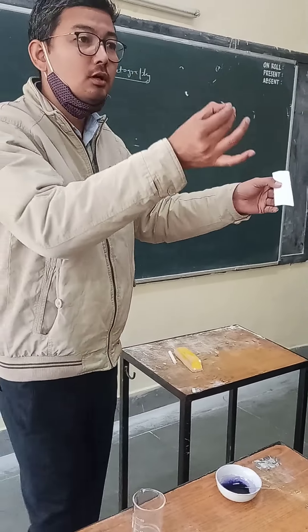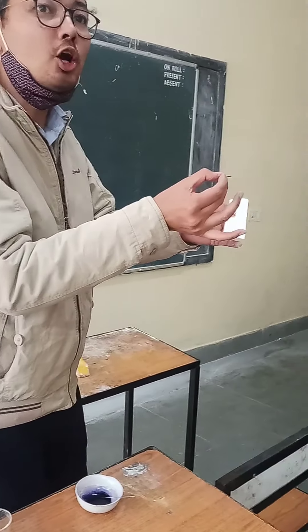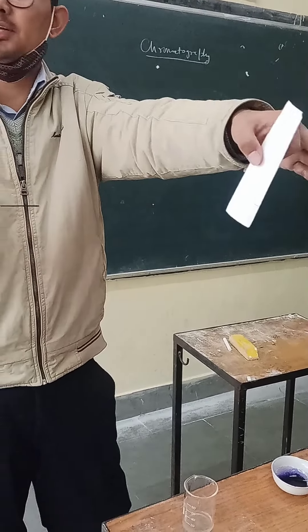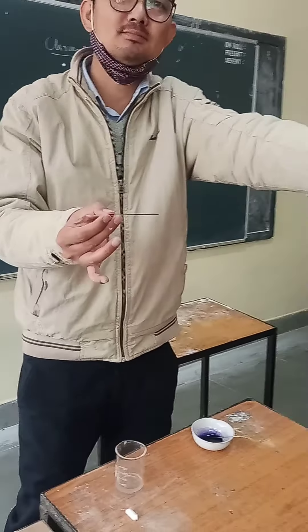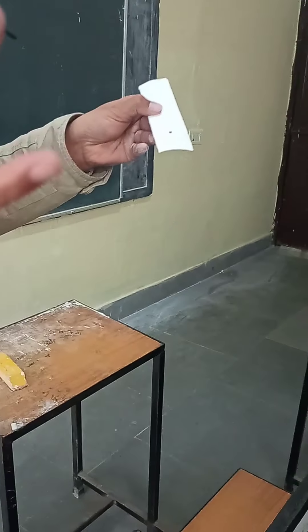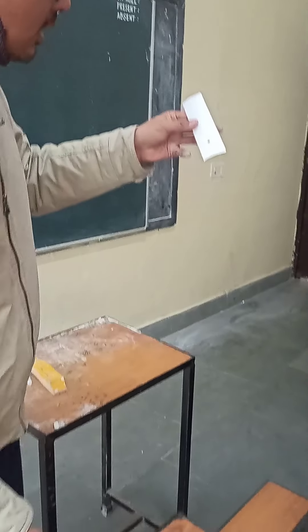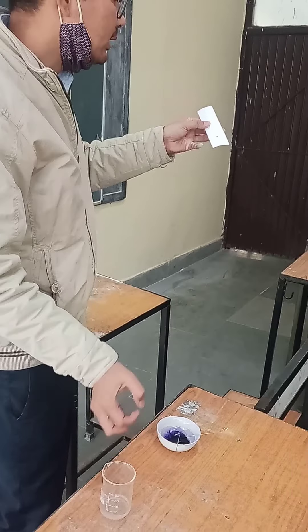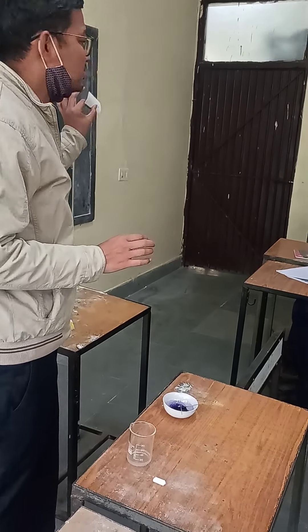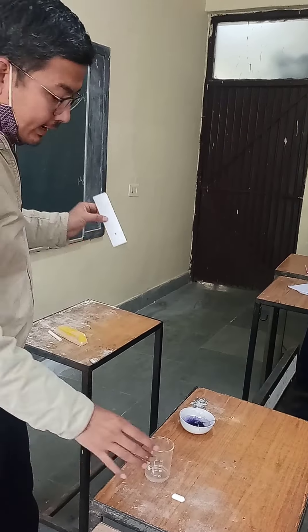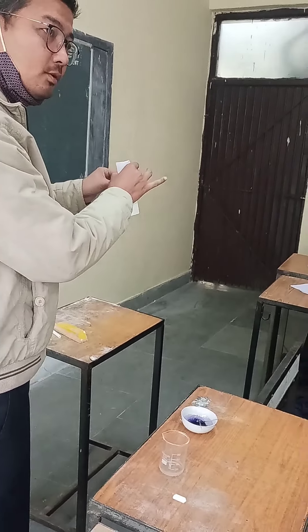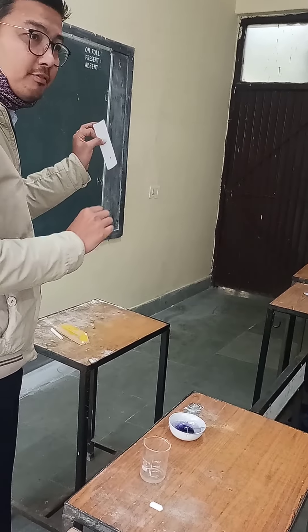You have to touch the paper gently so the drop does not spread and is not too large. Touch it like this and then take it back. Now allow it to dry. Sometimes you can further concentrate it, but one drop is enough. Write your roll number on the paper so you can identify it.